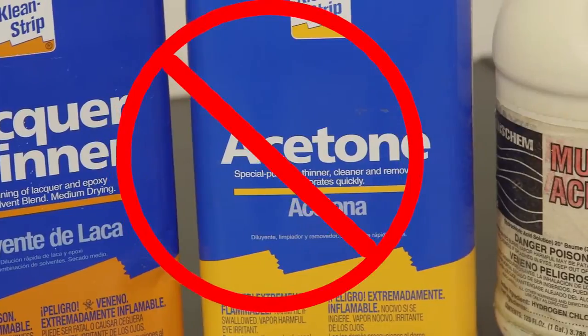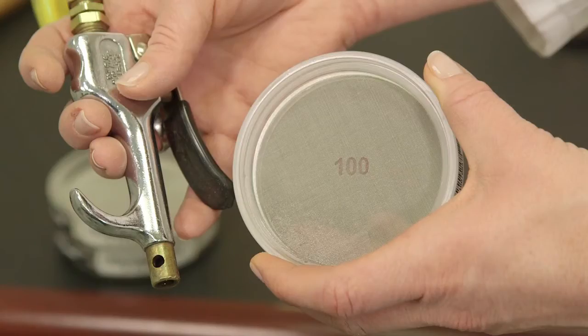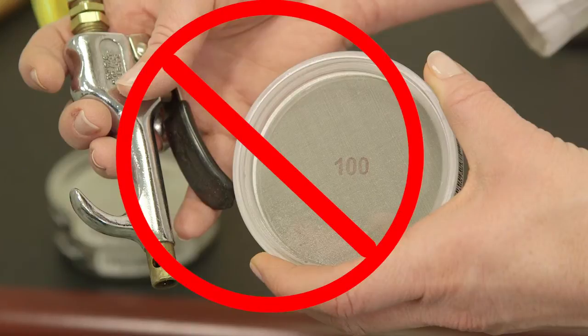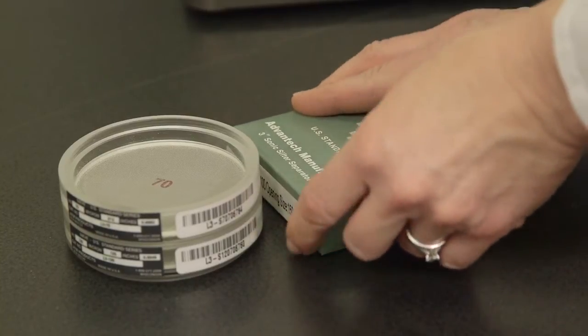You may wash them in a mild solution of detergent and warm water. Use of solvents, acids, or other cleaning agents is not recommended. Do not use forced air on number 100 or finer wire cloth, as screen damage may result. Always store your test sieves in a clean, dry environment.